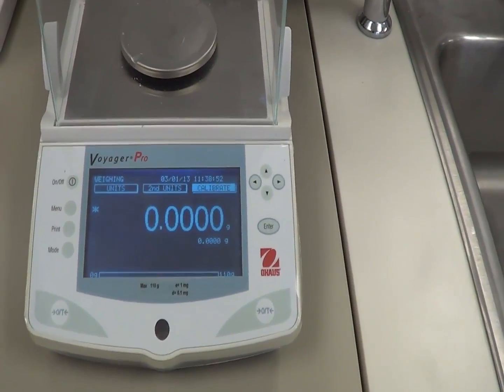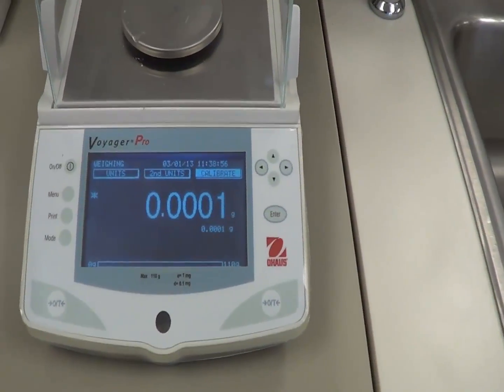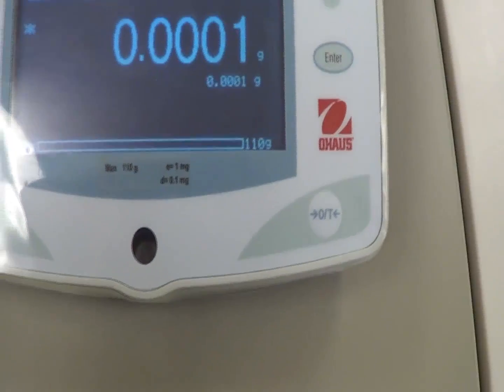Welcome back. Today I am going to show you how to calibrate the weighing balance. Okay, right now this weighing balance is calibrated.